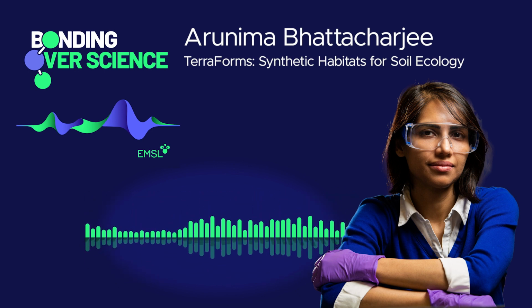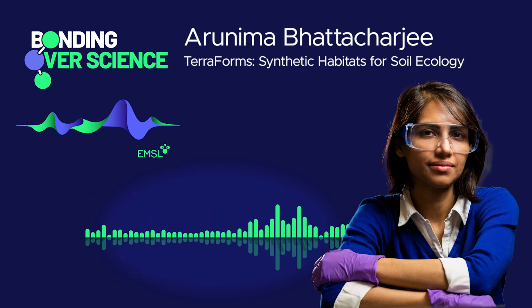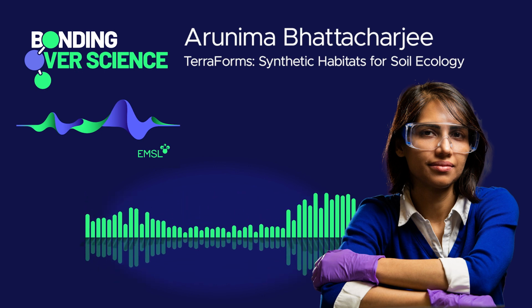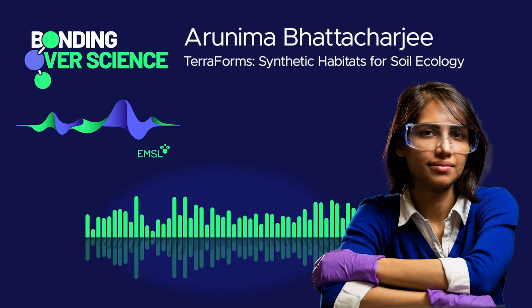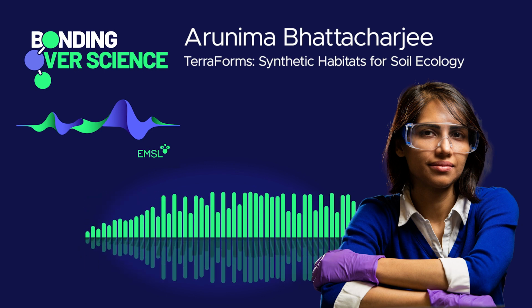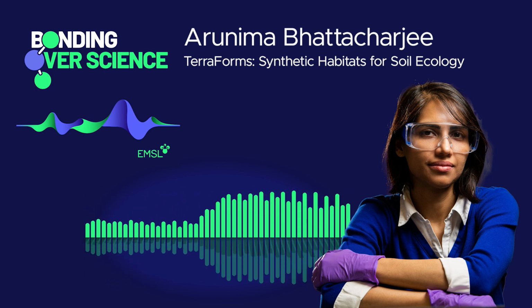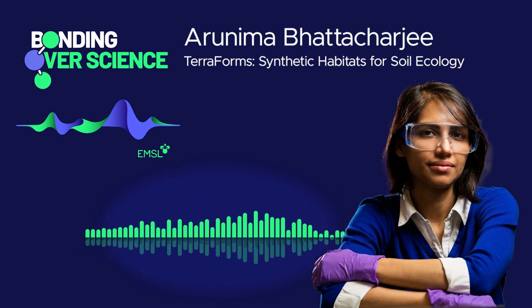Right. And I'm curious if it's easier to create this synthetic version of these habitats as opposed to doing straight field work. I don't know about that. I'm not a very field work person. I have worked with soil in the past, but someone else obtained the soil for me. It is certainly easier to incubate inside of these devices. You're able to do some very basic research. You can really look at mechanisms, but I don't think these devices should be used by themselves. I think these should be used concurrently with the existing techniques to study soil. Only then can we get a full picture.